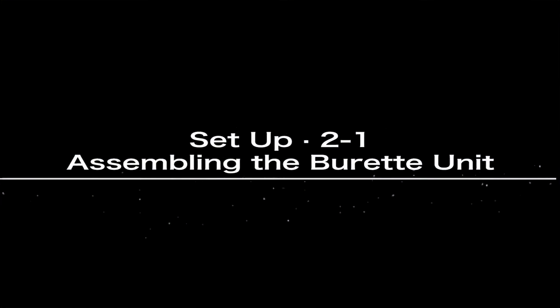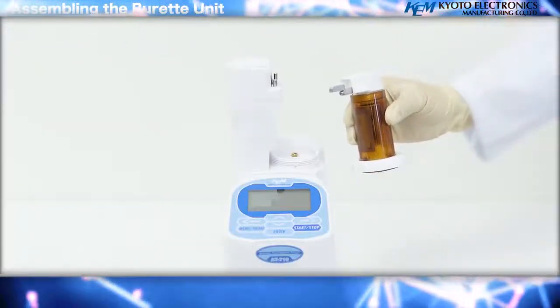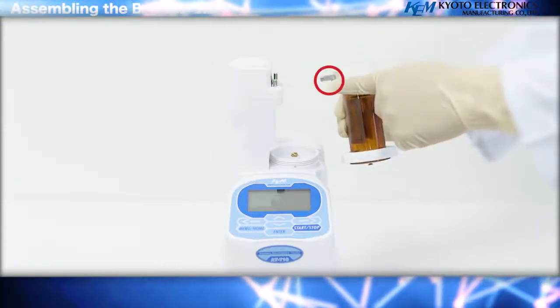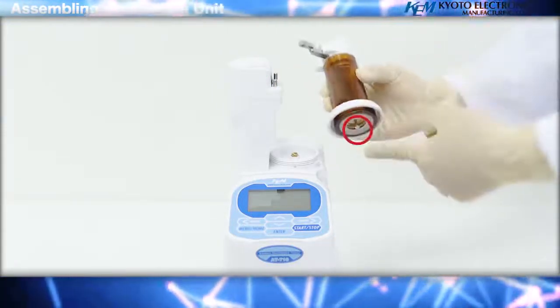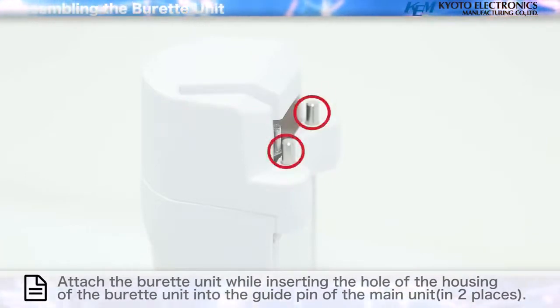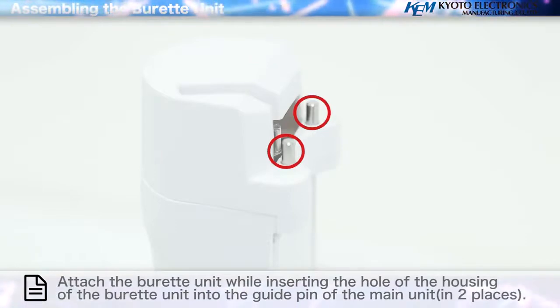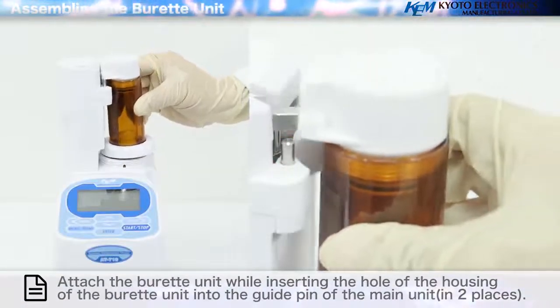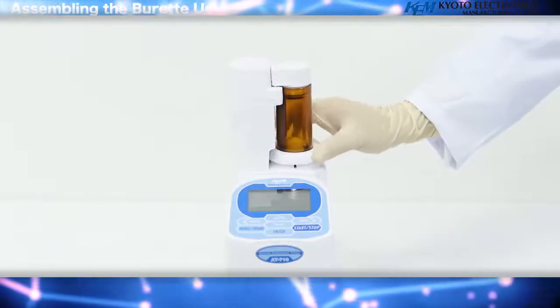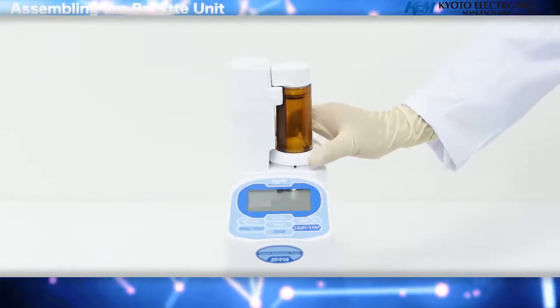Assembling the Buret Unit: slide the Buret Unit from the right and hook the piston pushrod of the Buret Unit to the drive screw of the main unit. If you put the housing on the guide pin of the main unit and slide it, it will be easier to adjust its vertical position. Attach the Buret Unit while inserting the hole of the housing into the guide pin of the main unit in two places. Tighten the retention screw to affix the Buret Unit in place.